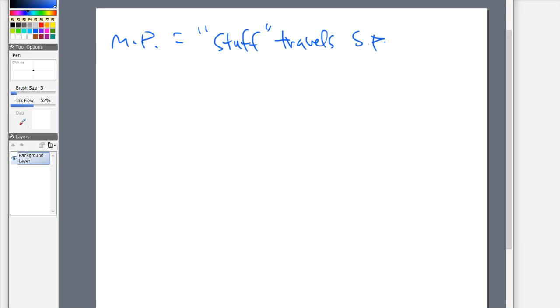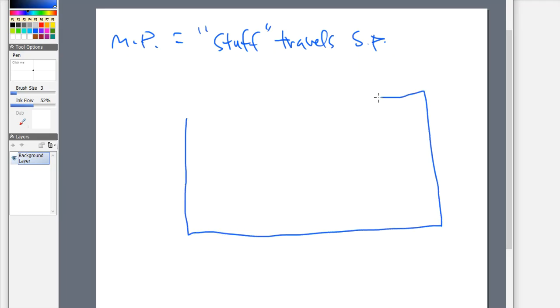And now you're scratching your head. And now you're saying, well, wait a minute now. Wait a minute. How does this even make sense? If I'm making a developing solvent and I'm pouring that developing solvent into the bottom of this tank, you're telling me that that's not the mobile phase that's going up the plate? No, it's not. And we've kind of already mentioned this. Because what's going to happen here is that I'm going to make a developing solvent. I'm going to take something and I'm going to pour it into that tank. And when I pour it into the tank, I'm putting a lid on it.